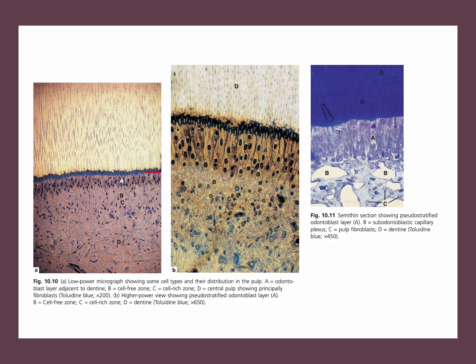You can see here the odontoblastic area. As you can see here, the cell-free zone is not visible at this area, or is not really obvious. We can find the cell-rich zone. These sections are most probably taken from the root.